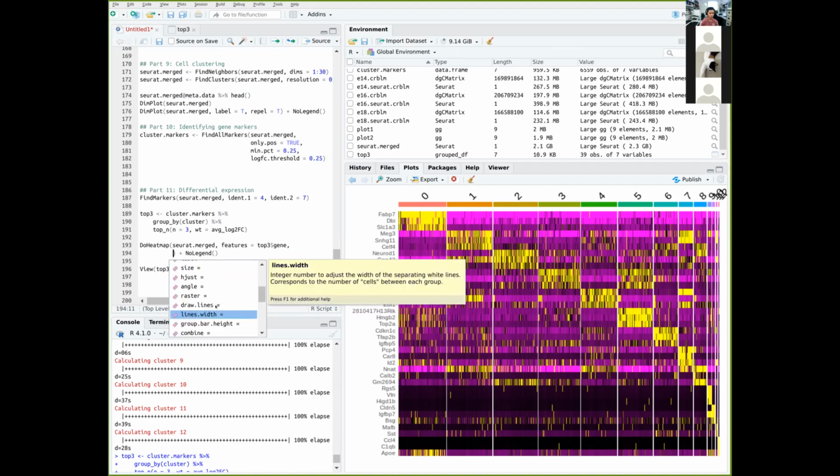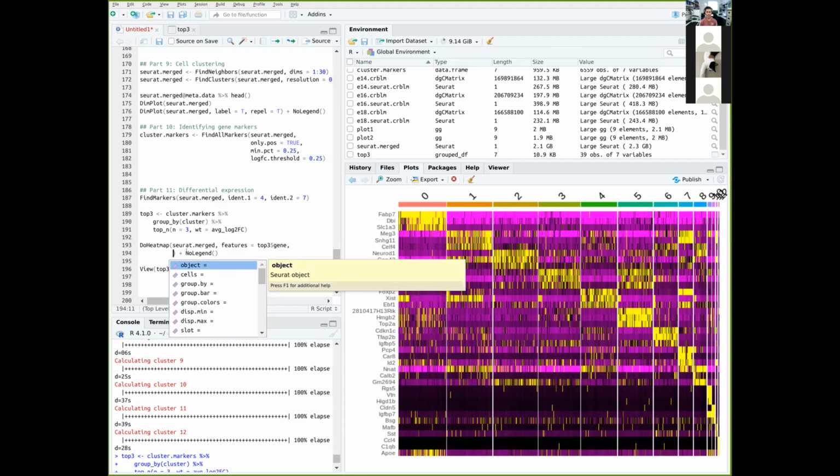Yeah, probably they don't have this here. It's just display mean group colors. Okay. I was expecting some sort of ident, like to provide a vector of ident. But if they don't have it, it's fine.